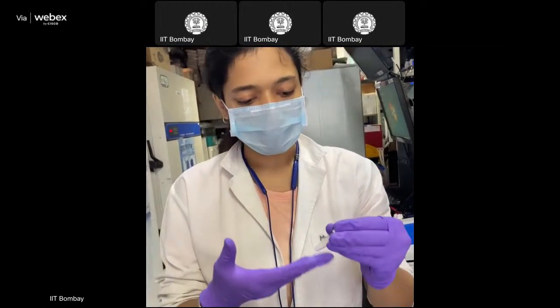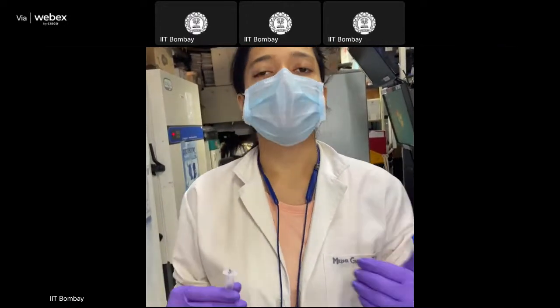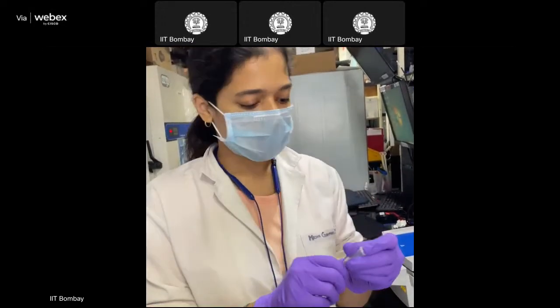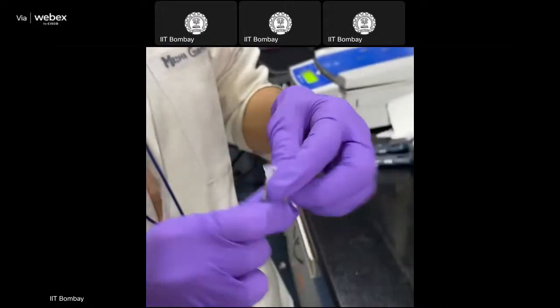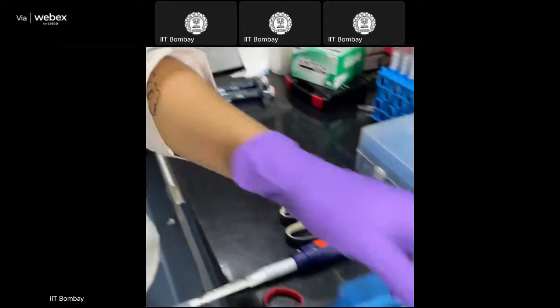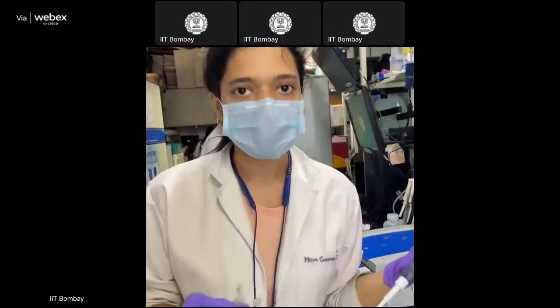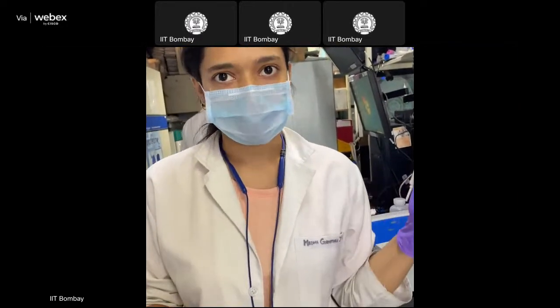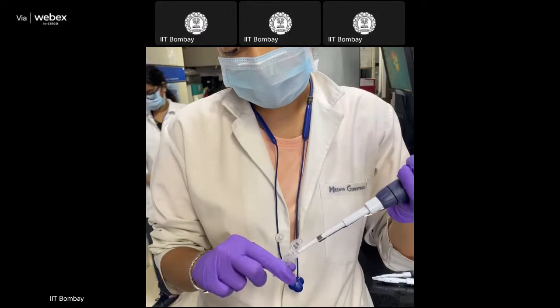So we take these eluted peptides and use a vacuum dryer to dry them. Now they are dried, and we add 0.1% FA. This is 0.1% formic acid in water. The water is definitely MS grade water, because now everything is going into the mass spec. We need to be very sure, right from the digestion step until the mass spec step, that everything is good MS grade.